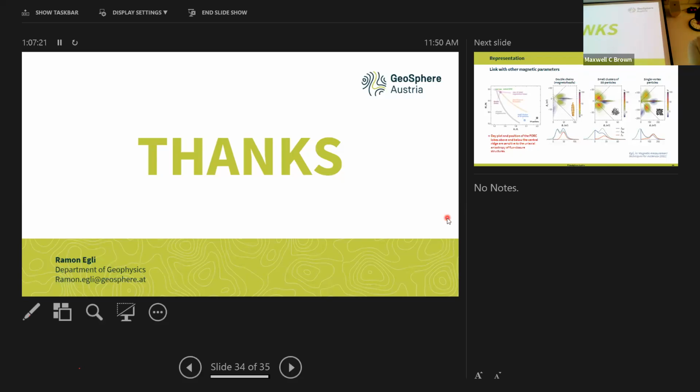Ramon, congratulations. I think you're operating at a Pike level of carefulness with measurements. I mean, he would put a plastic bag over the air conditioning vent and take them all up. In those days, it was an AGM, probably. We've said in our papers, the more care you take in your measurements will be rewarded in the interpretability of the results. So I think that's obviously true. But the concern is always, do we have to become an expert like you to be able to make good measurements? And that's always the worry, right?